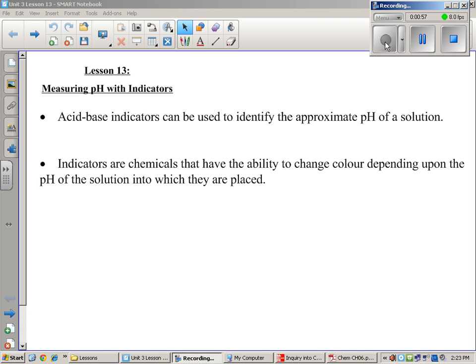So today, your job is not going to be, hey, this is a pH of 3 or a pH of 2. You can't do that today. What you can do is say, today's pH for this solution is between 2 and 4, for example. That's the best you're going to be able to do. Or perhaps 3.8 to 4.6. So you're going to be able to narrow it down, but you can't get a specific value today. I don't want to see any numbers like, hey, I think it's 5.8, because it's not, okay? It's a range, okay?